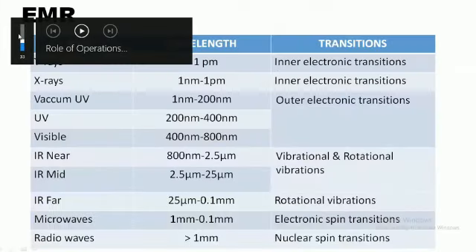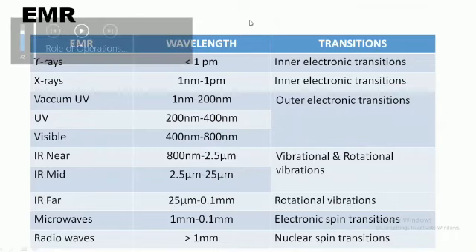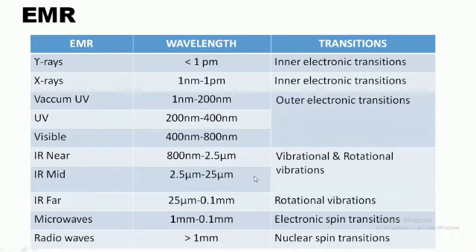To make sure that we go ahead without any problems, you have to keep looking at this table. I don't ask you to learn it by heart. If you memorize these wavelength values, you might go through another book and say, sir, whatever you have taught is wrong.